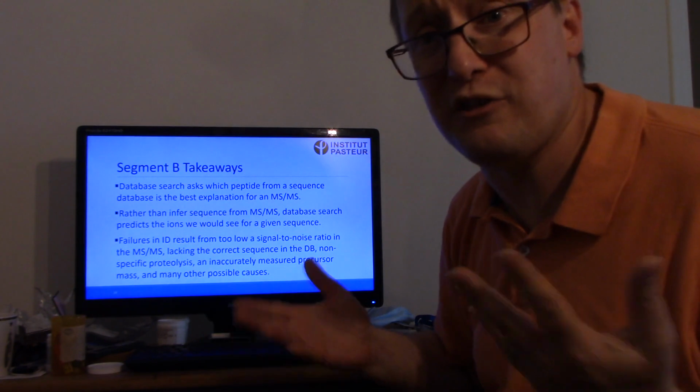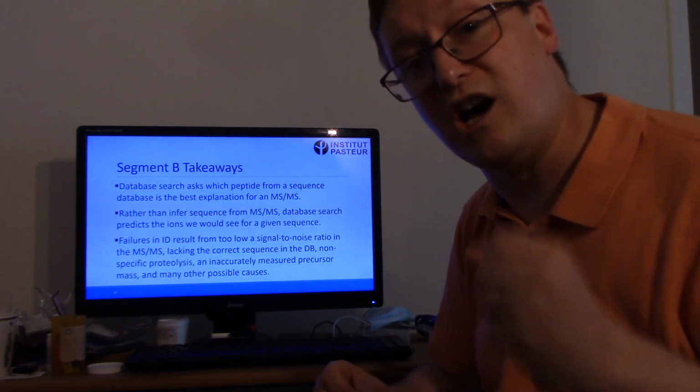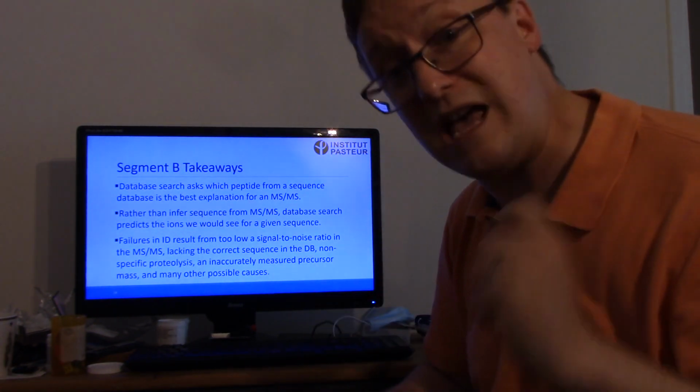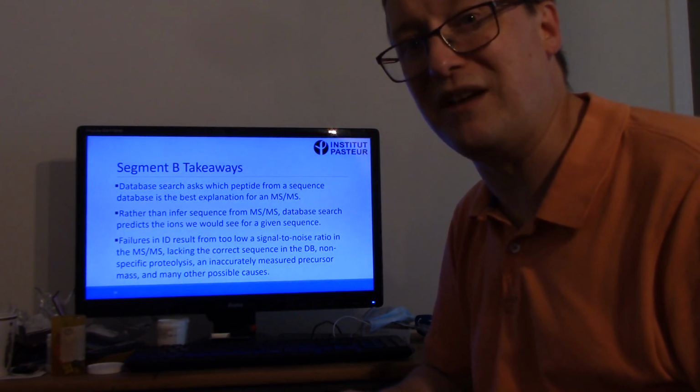There are other reasons too. So this technology is not bulletproof. Not every tandem mass spectrum is going to have its correct sequence on the top of the list. And that means we're going to need some way to assess error, which is the next segment of this video.